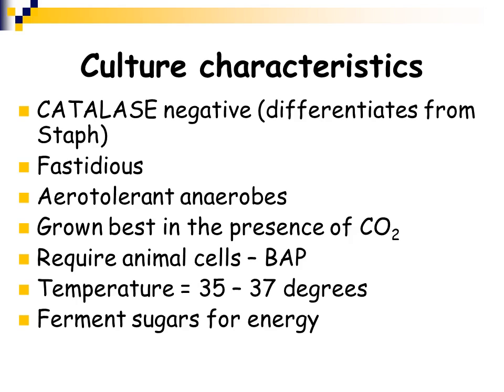So again, Streptococcus are all catalase negative, and this is a key test to differentiate the staphs and the streps. Streptococci tend to be a little bit on the fastidious side. They are aerotolerant anaerobes, so they don't like to be in high oxygen levels. They grow best in the presence of CO2, so they are commonly grown in a CO2 incubator. These are incubators that usually have between 5 to 10% CO2 constantly going into the incubator to keep them without quite so much oxygen in there.